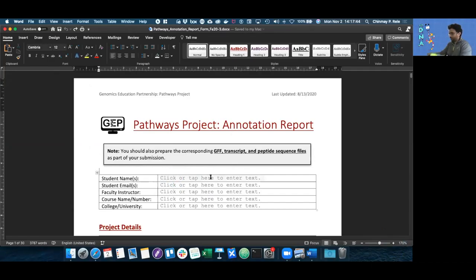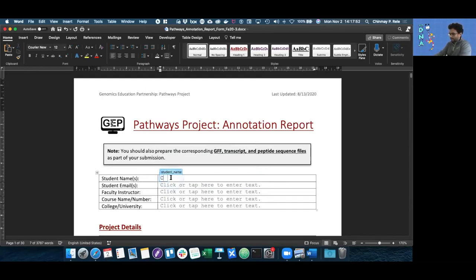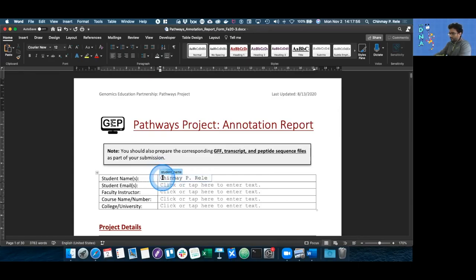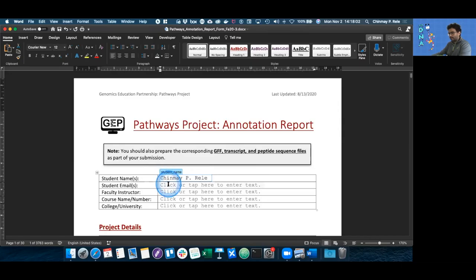Let's start off first with the student information table. We need your information because we will need to be able to contact you. I'm just going to add in my name right there. Just remember that when you type something in, it's going to be auto capitalized.